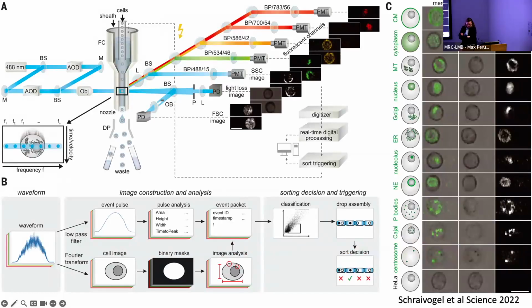And so to enable the blur-free imaging at a fairly high flow speed of 1.1 meters per second, it uses this FIRE approach, which produces an array of 104 laser spots across a 60 micron beam within the core stream of the sorter cuvette. And each of those spots is modulated at a unique radio frequency. And so that's able to then create an image of the cells.